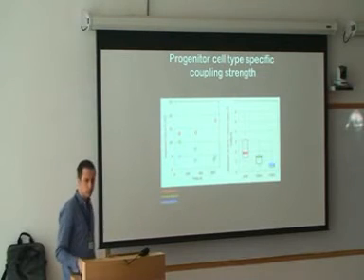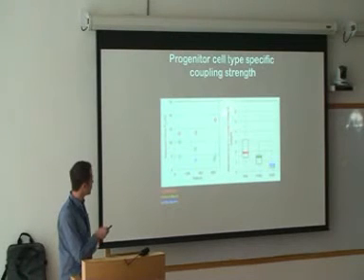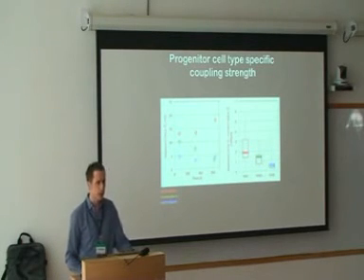To exclude that this is the explanation, we divided the separation force by contact area, getting a stress, and looked at ectoderm, mesoderm, and endoderm. Still ectoderm is higher than mesoderm and endoderm, indicating that the difference in separation force is not just due to ectoderm having bigger cell-cell contacts.